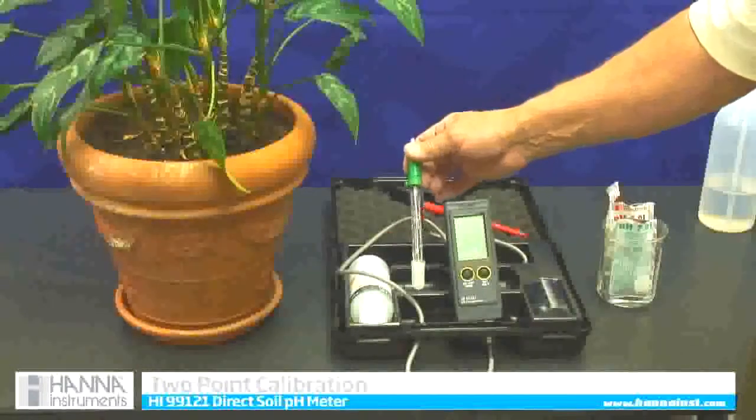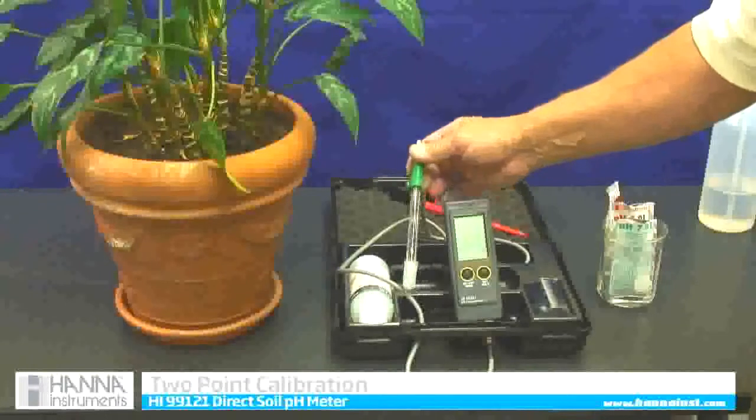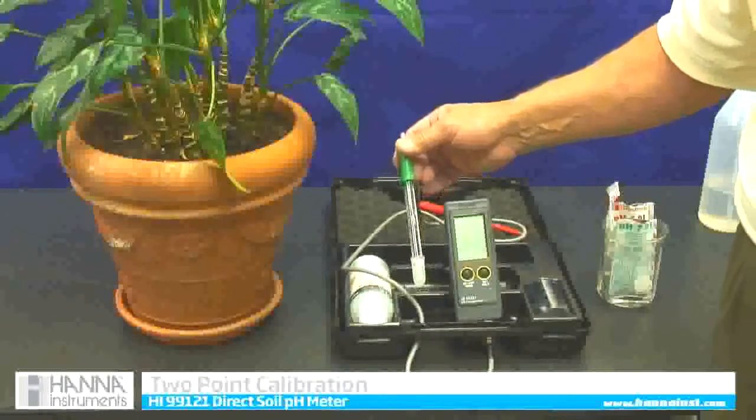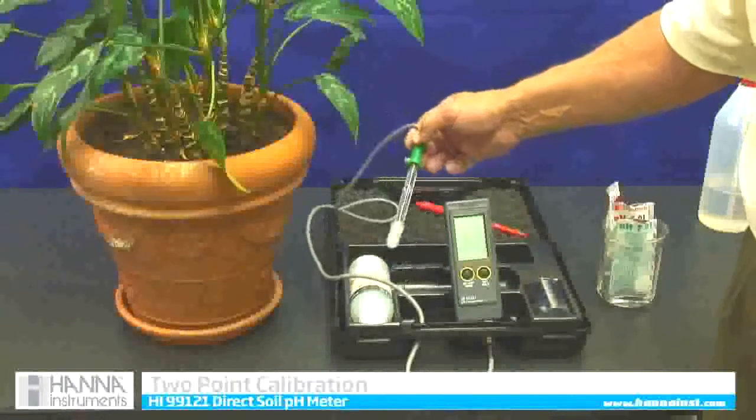The first thing we have to do before we use it is to calibrate it. This is a self-calibrating meter. All we have to do is get it into calibration mode and then follow what the screen says.